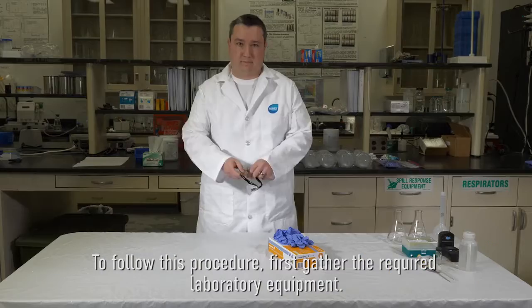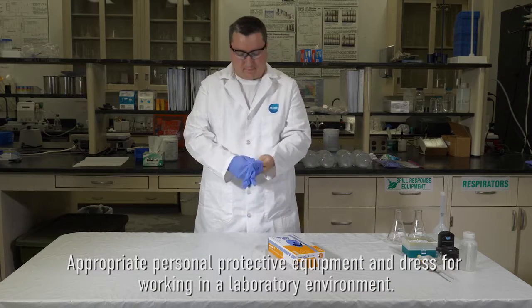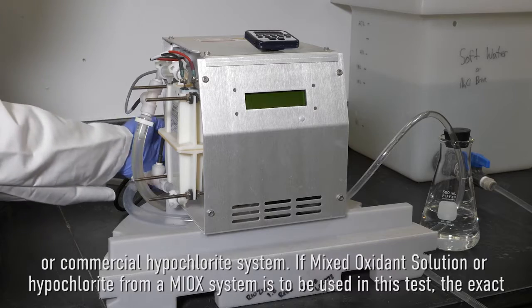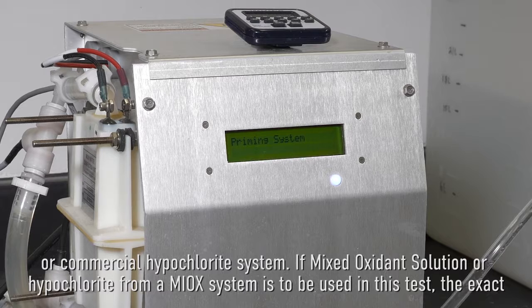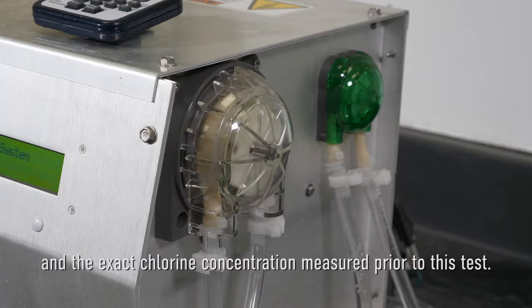To follow this procedure, first gather the required laboratory equipment. Appropriate personal protective equipment and dress for working in a laboratory environment. The source of the oxidant to be used in the test, including Miox MSR disinfection pen, Miox commercial system, or commercial hypochlorite system. If mixed oxidant solution or hypochlorite from a Miox system is to be used in this test, the exact chlorine concentration of the oxidant needs to be measured prior to beginning the test. If a commercial hypochlorite solution is to be used in this test, the solution should be diluted to a chlorine concentration of around 1% and the exact chlorine concentration measured prior to this test.